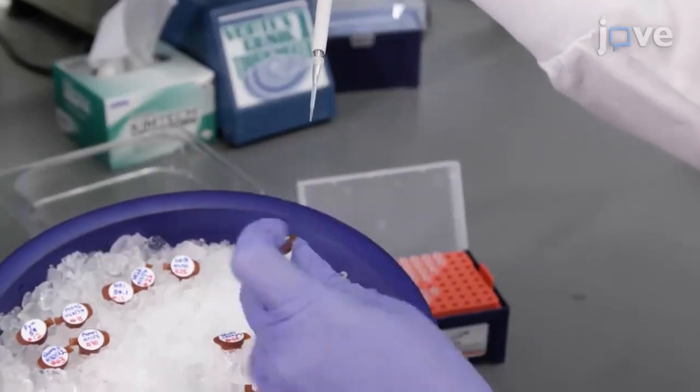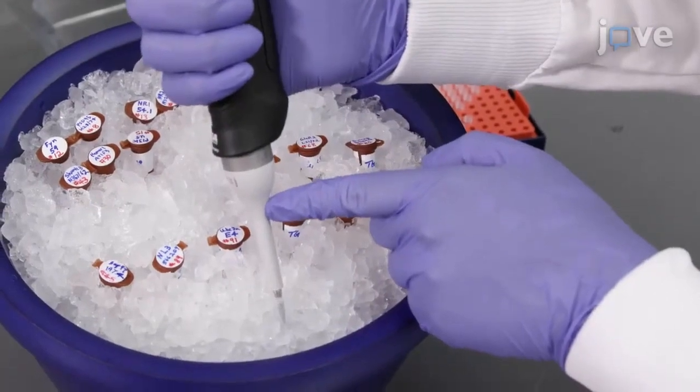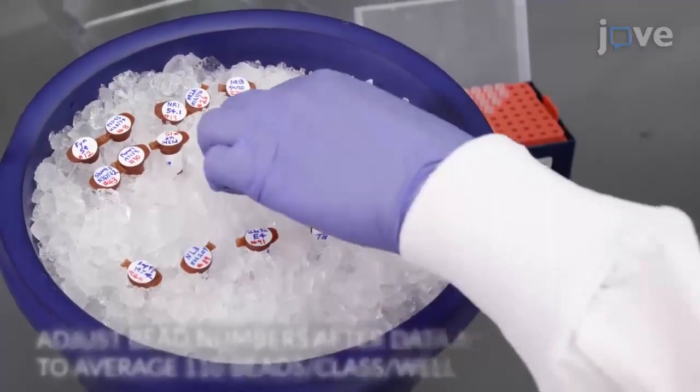After normalizing the protein concentrations, prepare a magnetic bead master mix that contains approximately 250 magnetic beads of each class per well.